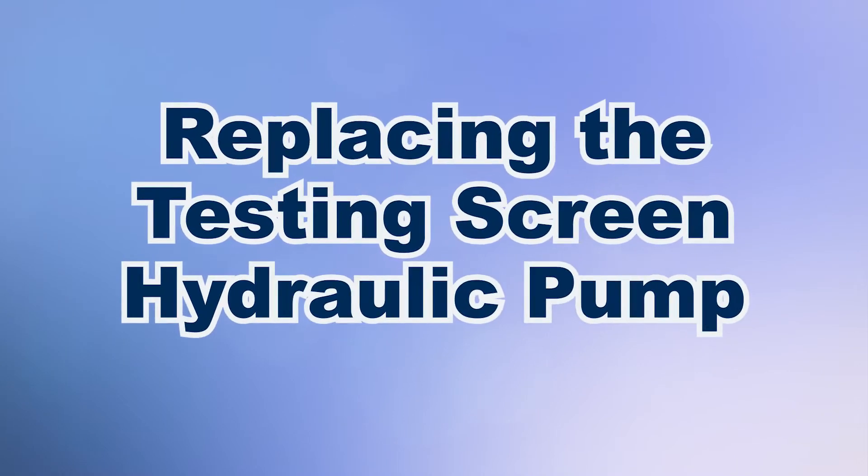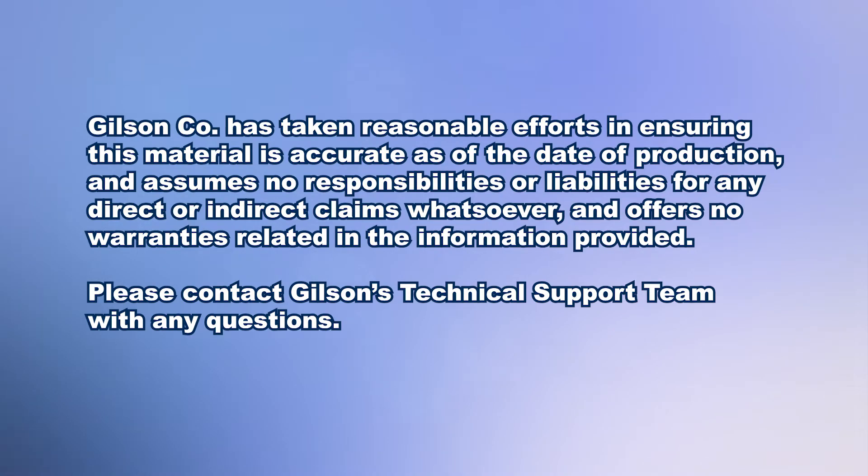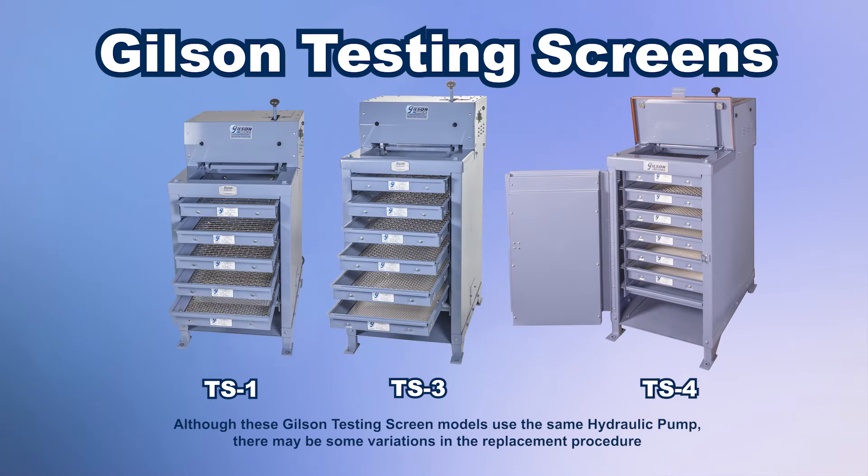Today we're going to demonstrate how to replace the TS1 testing screen hydraulic pump. The Gilson testing screens are rugged, tough machines that use a quick-acting hydraulic pump system to clamp and release the screen trays within the unit.